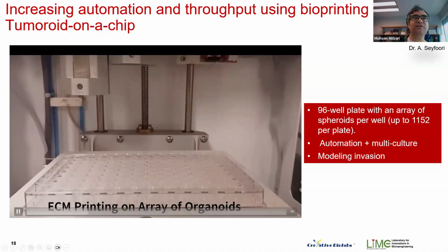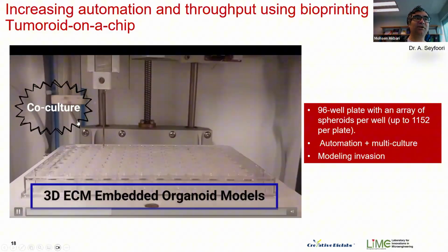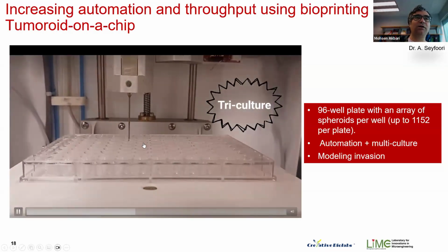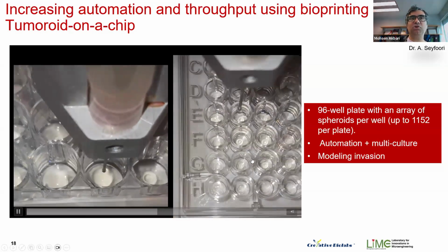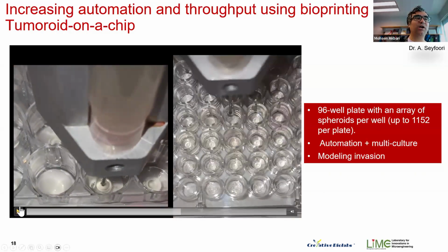So what he did was create a 3D printer and adapt it to deliver materials, including hydrogels and cells, directly into these wells.